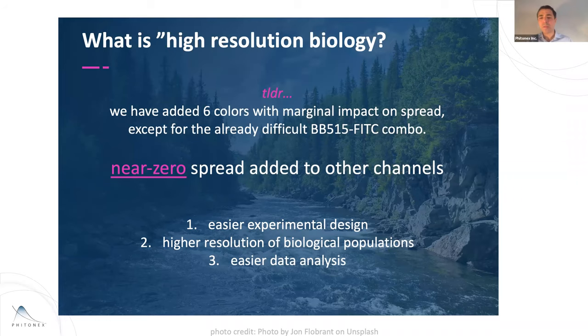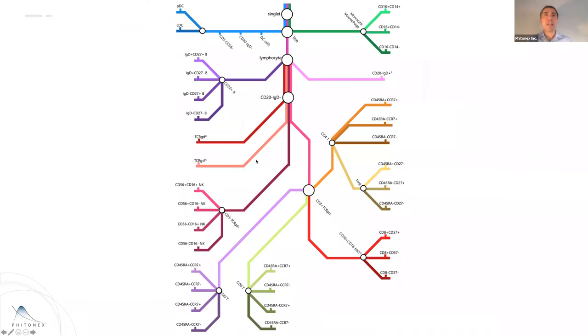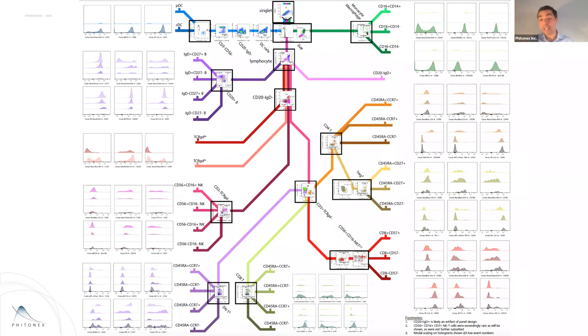And so, we've also created this subway plot, again, to make this data accessible and hopefully interesting. This has had a life of its own, honestly, for us thinking around how we do multicolor phenotyping. Again, it applies across all the different experiments that we talked about, right? How do you make the phenotyping that we do in flow cytometry relevant to certainly a broader audience, and then take that in and map the data on this.